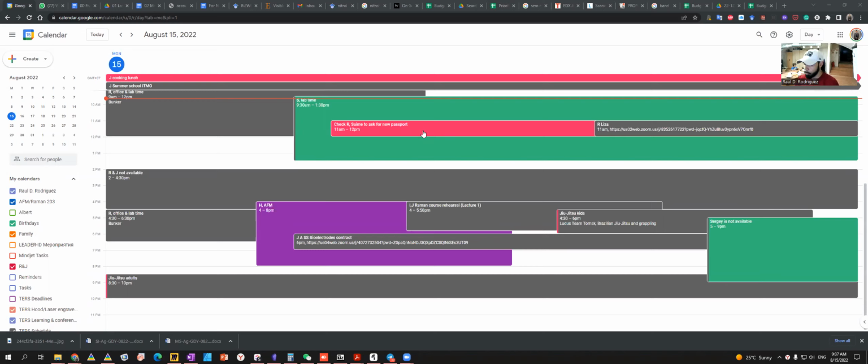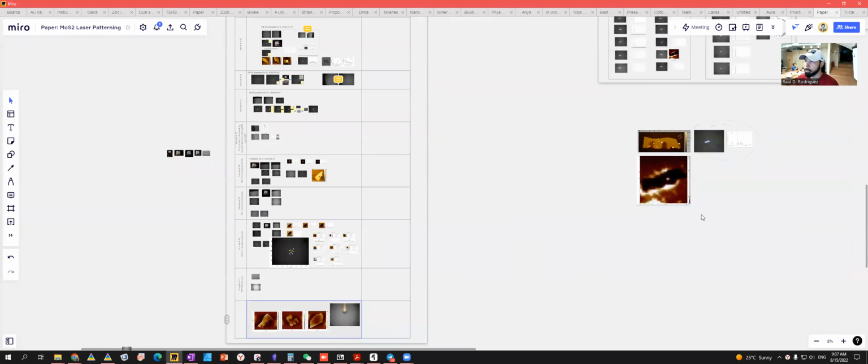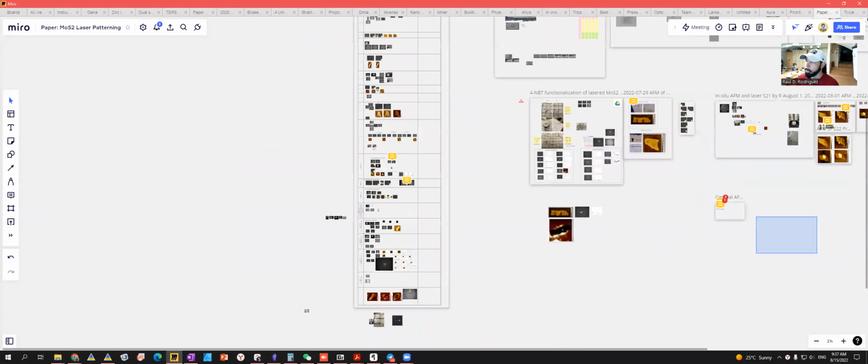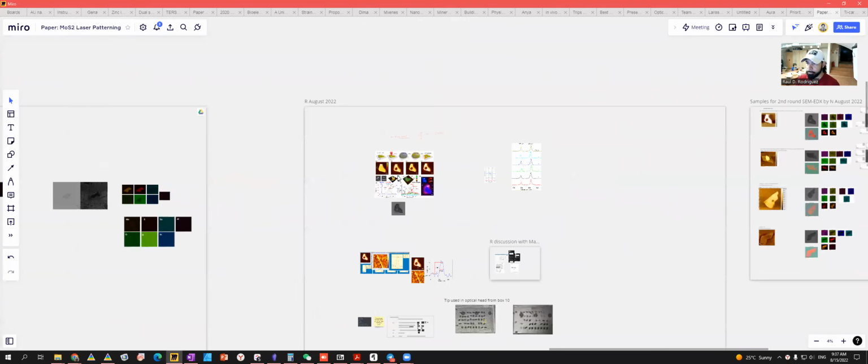Okay, some of the things that we always need to do is to process the data. There are different ways of doing it, but the final product is to identify those that look like this. You can make these figures in the end. So what do we have here?